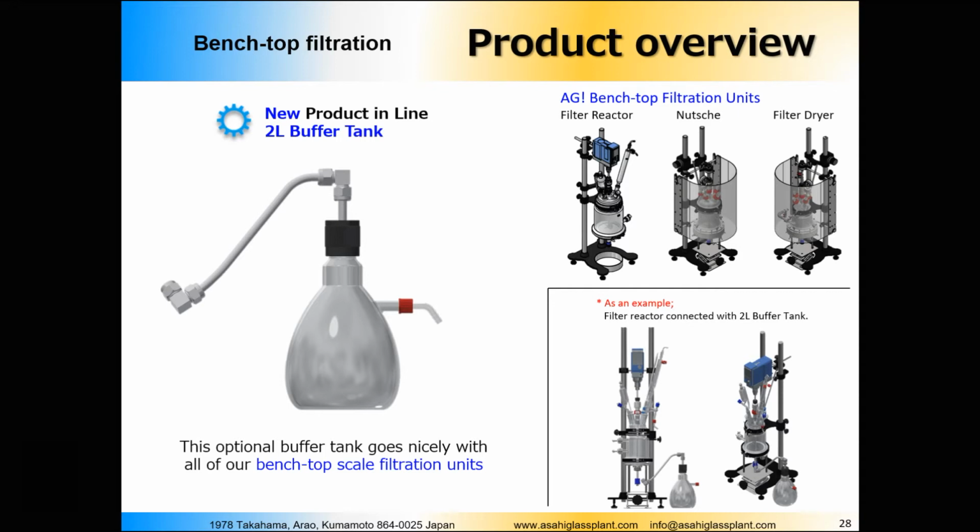For example, when we purchase a 1 liter reactor which has an M16 thread on the jacket connectors, and we purchase the triple wall reactor for low temperature synthesis, most of, for example, the Huber Unistats, or it doesn't really matter, any other units like from Lauda, for the lower temperature thermostats, they have a thread of M30 on the thermostat.